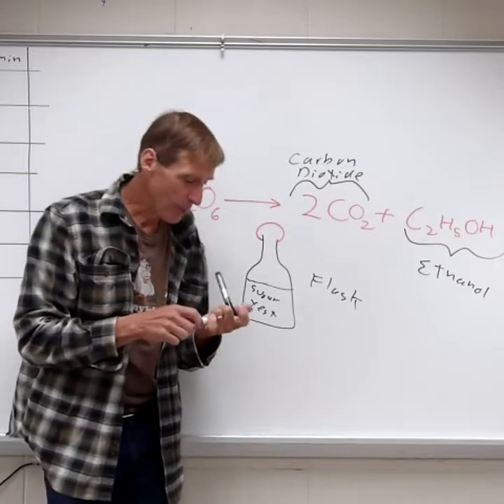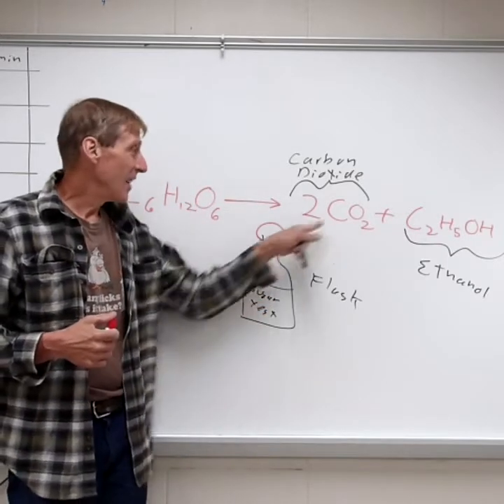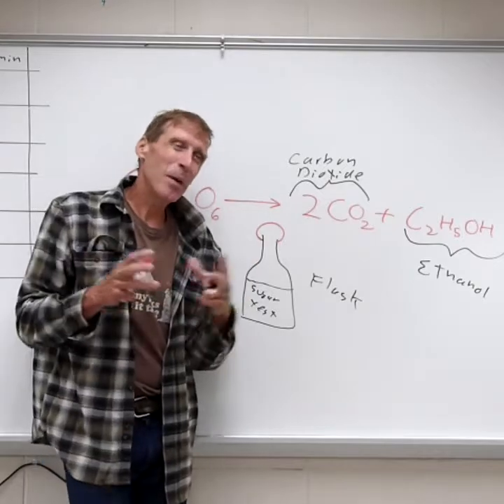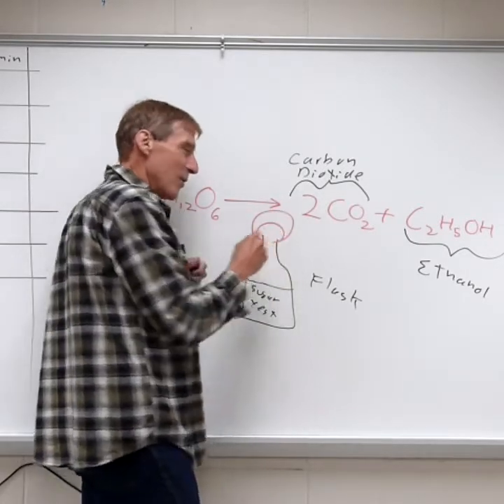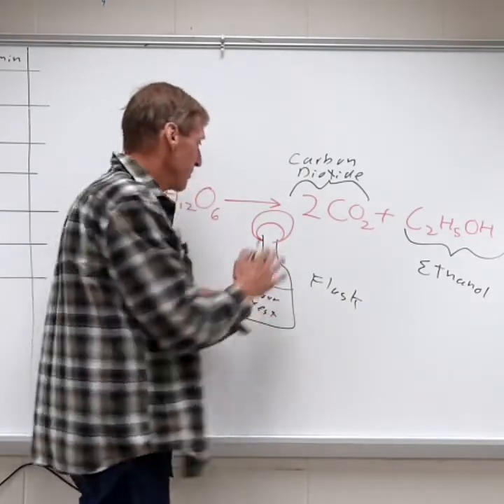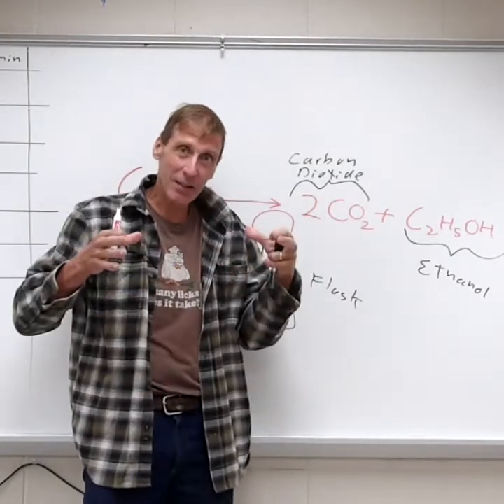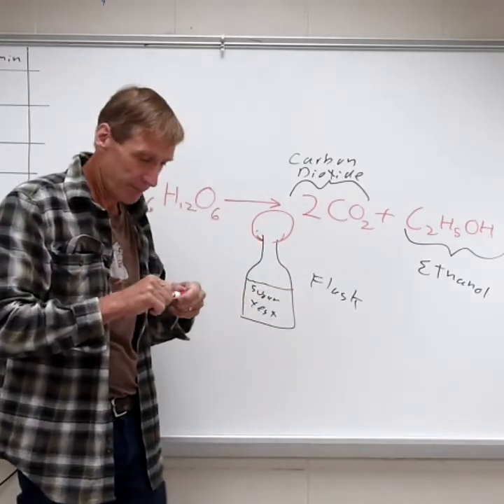Now, one of the assumptions we're making is that as fermentation occurs in this fluid, the CO2 that's produced is going to be released as a gas and inflate the balloon. Now, it's kind of a crude measure, so it's maybe just useful for relative comparisons. The bigger this balloon gets over time, we can make the assumption that more fermentation has occurred. So the way we're going to measure fermentation is by measuring basically the circumference of this balloon. The bigger it gets, the more CO2 is produced, the more fermentation occurred.